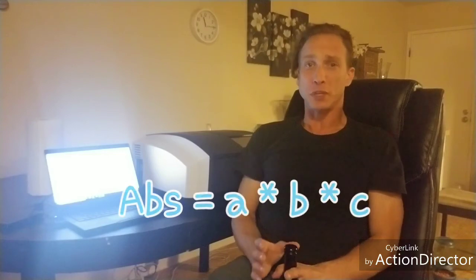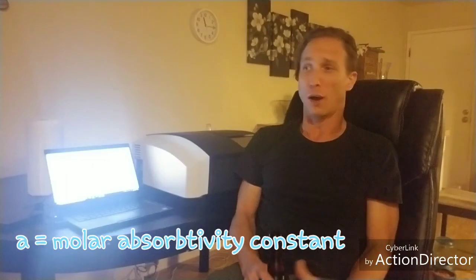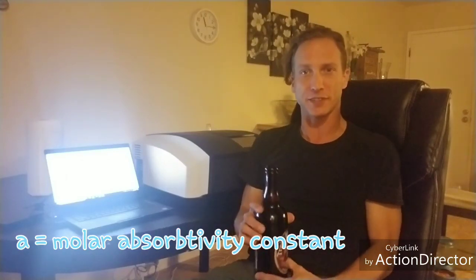So Beer's Law states that the absorbance is going to be equal to A times B times C. A is something we call the molar absorptivity factor. It's a constant. It's going to depend, in this case, on the beer, and I could demonstrate that with a beer.